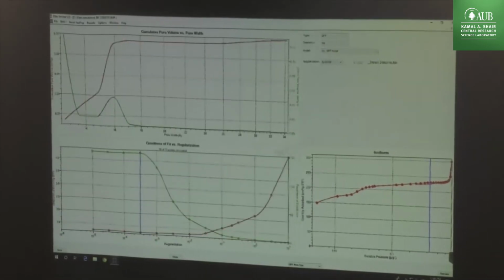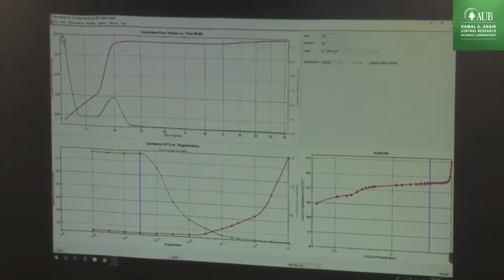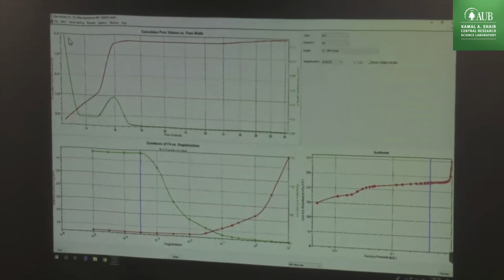Here we are. Okay, 16 Angstrom, and you have very large pores. You don't have points here. But this is an indication of very high presence of ultra micropores, because we don't have points. You don't see the curve, but what it's indicating is you have a very large micropore volume. We don't have points, but we would have something like this, in large volume. Okay, this is why it's so important to get so many points on a small portion of the pores.